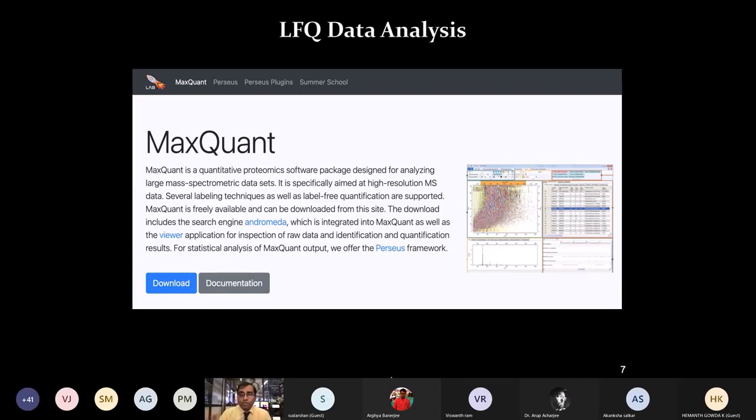That's why we are not spending too much time on this part, because this could also be very specific to whether you have a Q-TOF or a multi-TOF or you have Orbitrap. These parameters will change, right? So we are just giving you a flavor of it, but not spending a whole lot of time.